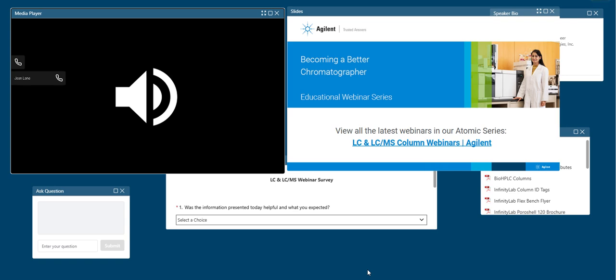Next question is asking, is a refractive index detector more effective for detecting polymers? You were cutting out when saying what type of detector it was. It says refractive index detector. Oh, okay, so the RI, refractive index detector? Yeah. Okay.